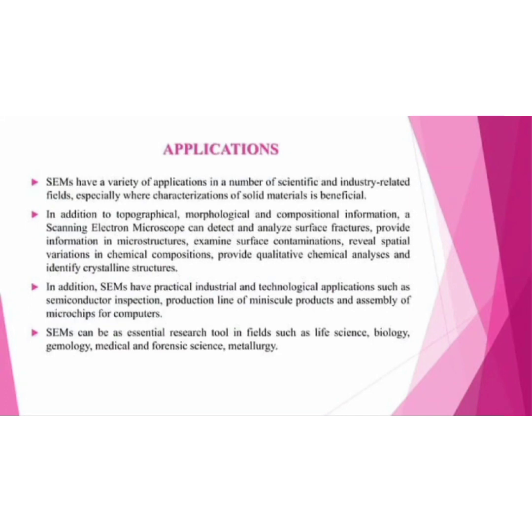Applications. There is a variety of applications in a number of scientific and industry related fields, especially where characterization of solid material is beneficial. Next, topographical, morphological and compositional information: the scanning electron microscope can detect and analyze surface fractures, provide information on microstructures, examine surface contaminations, reveal spatial variation in chemical compositions, provide qualitative chemical analysis and identify crystalline structures.